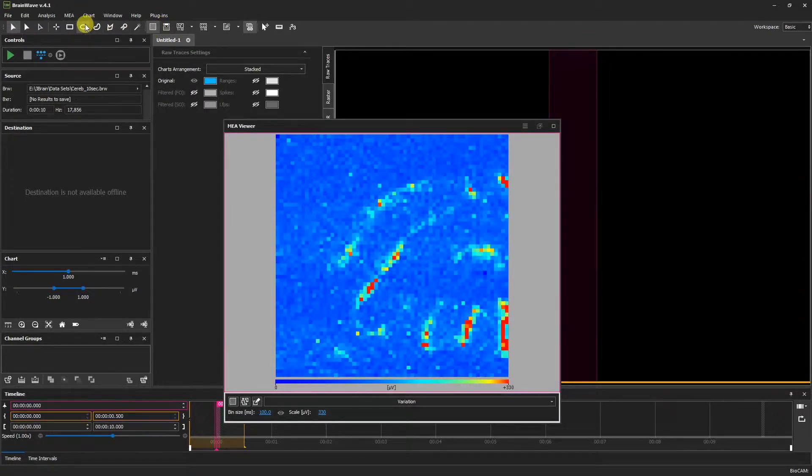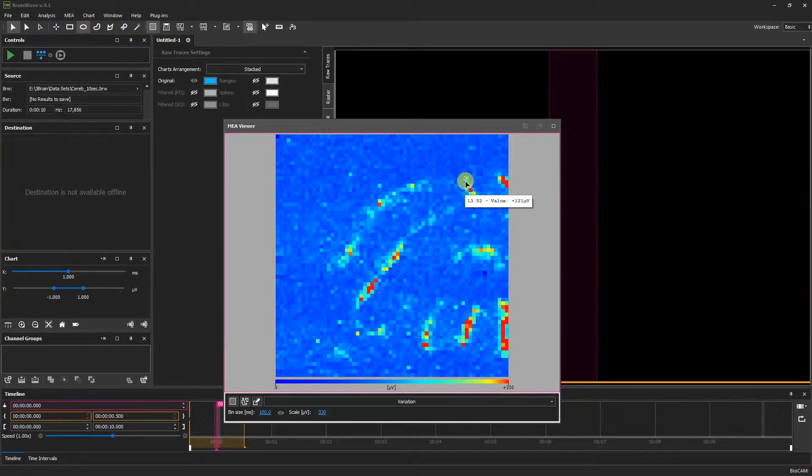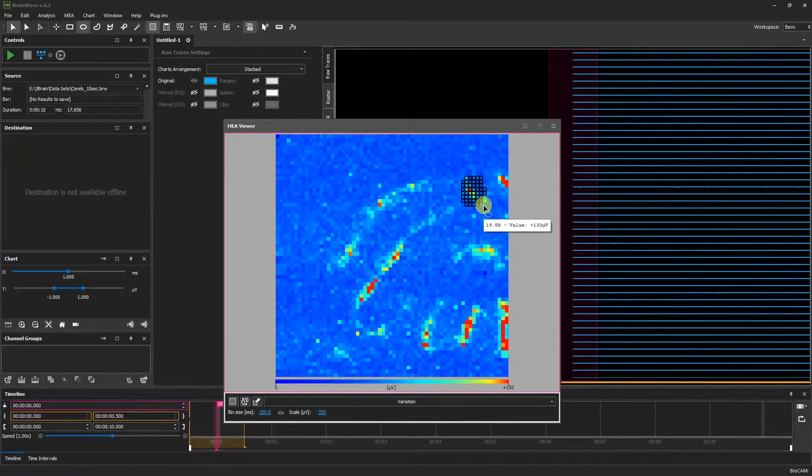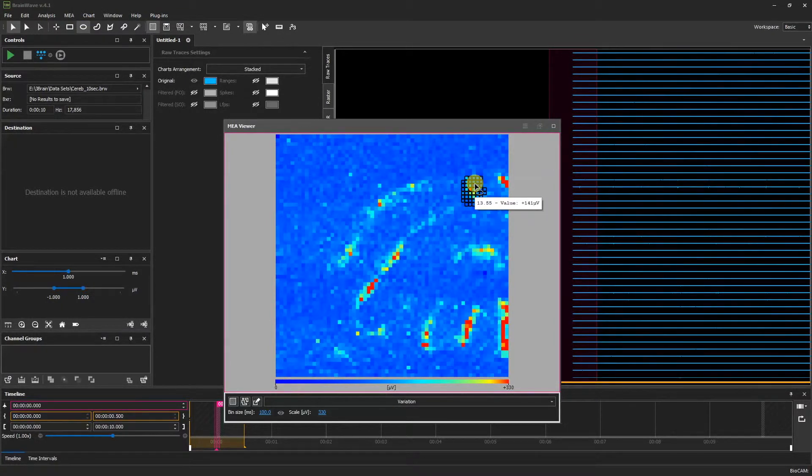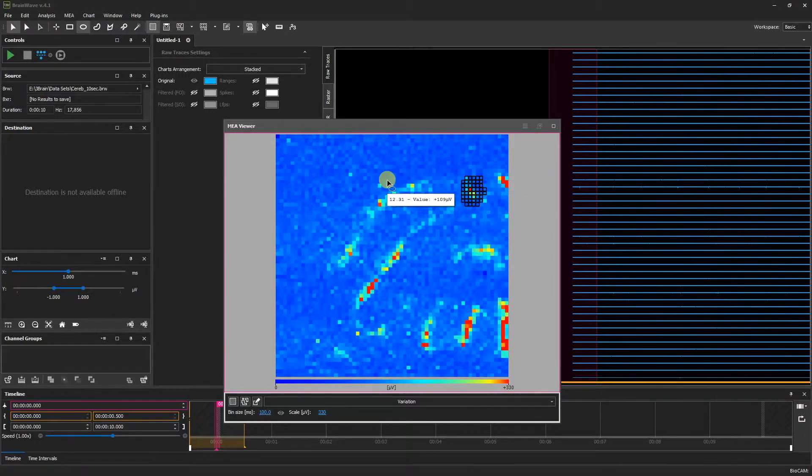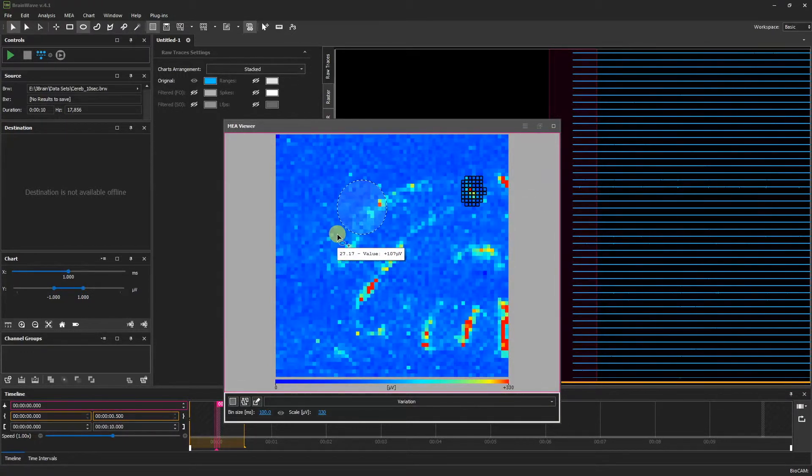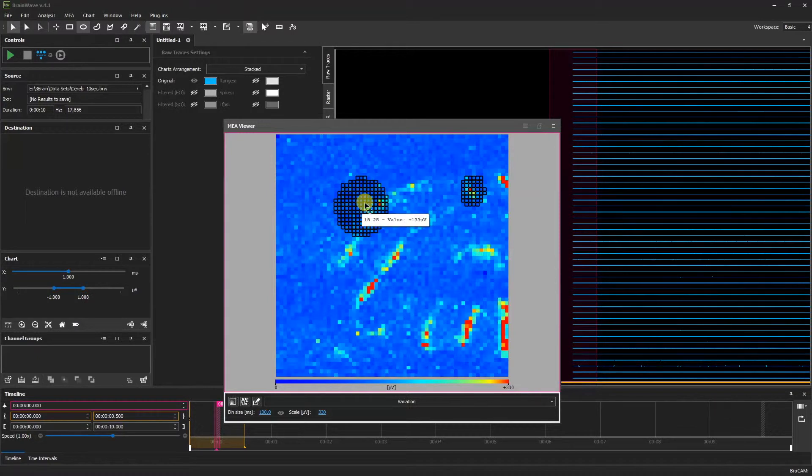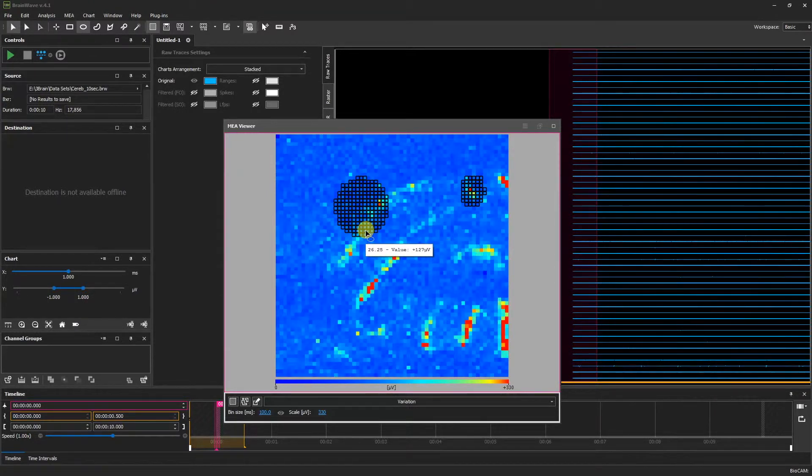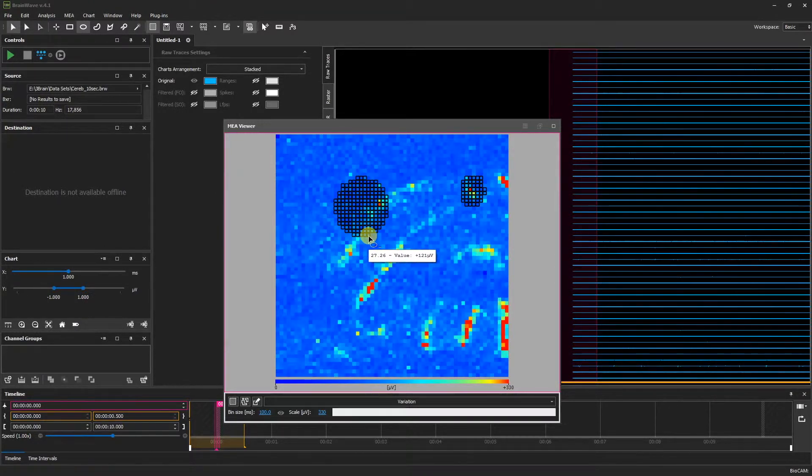Now we'll select the elliptical selection tool. By clicking and dragging on the MEA Viewer, we can make elliptical selections. If we wish to make multiple selections, holding Ctrl Shift on the keyboard and clicking and dragging will create another selection. If we wish to omit selected pixels, we can hold down the Alt key and click.